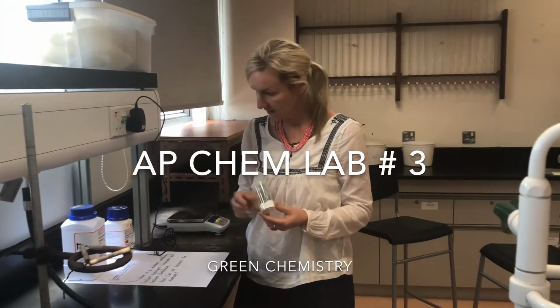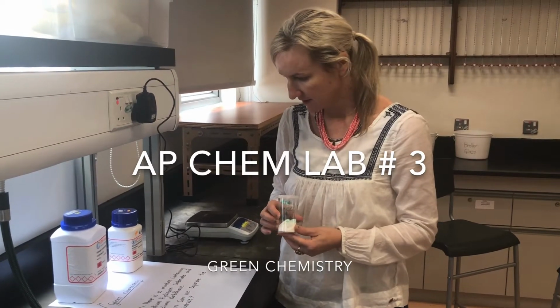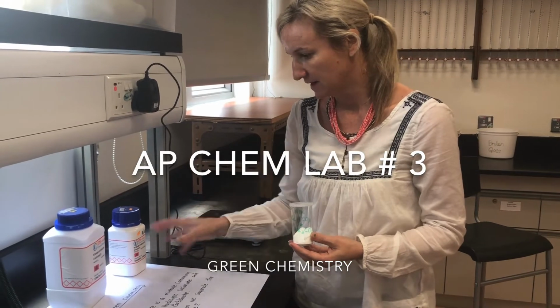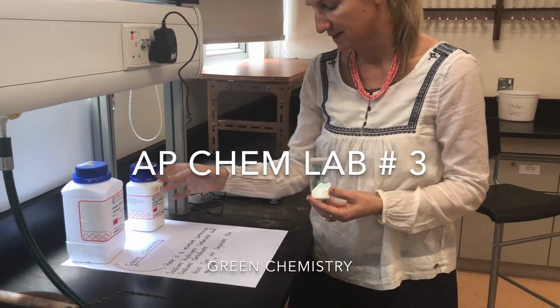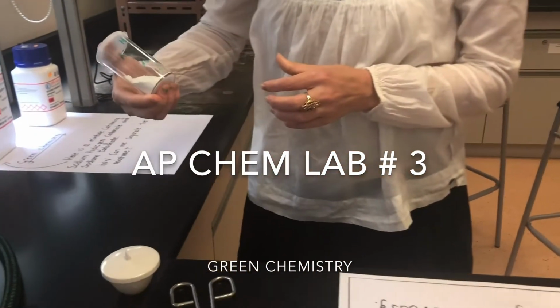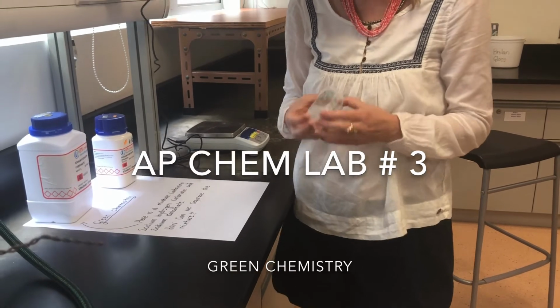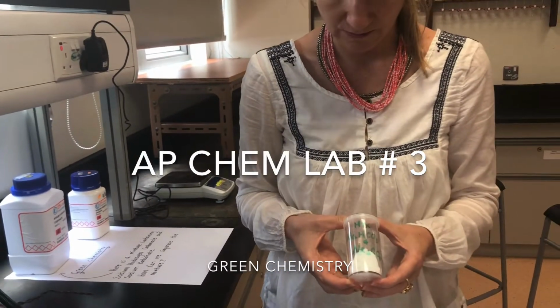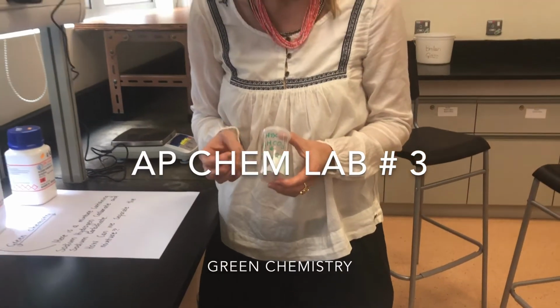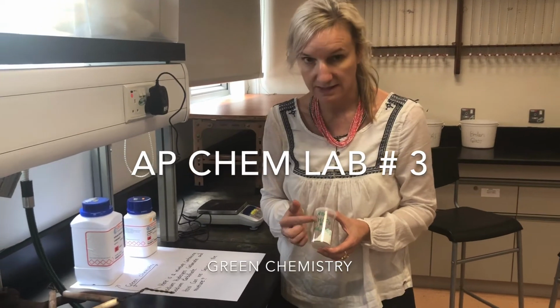Hi there, and today we are doing AP Chemistry Lab number 3, and the goal of this laboratory is to be able to separate two substances that have been mixed together. You can see in my little container that there is a mixture of sodium hydrogen carbonate and sodium carbonate. They've been mixed in here, and our purpose today is to be able to work out the percent of each substance in this particular sample.